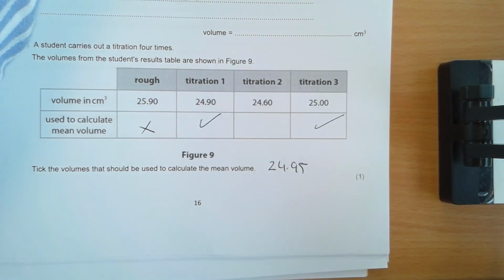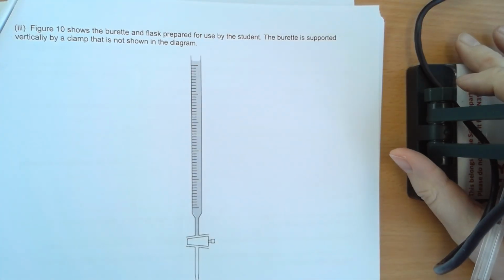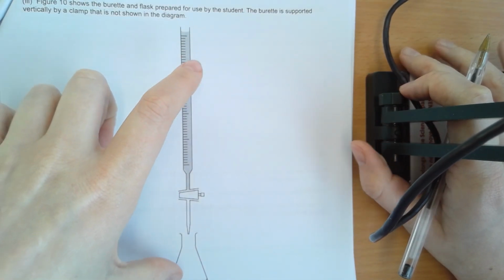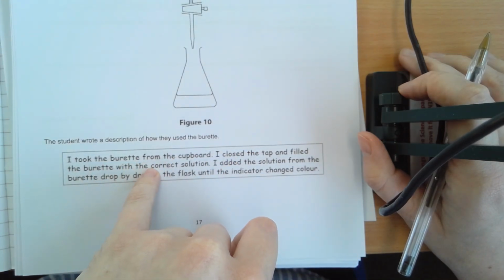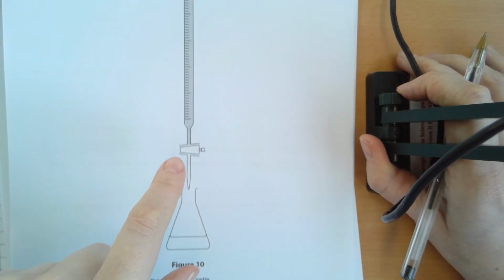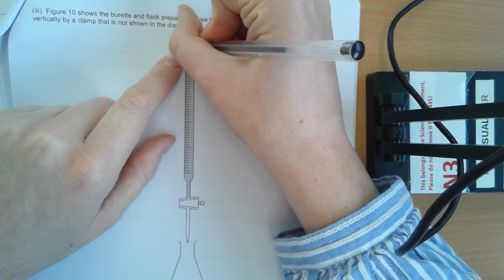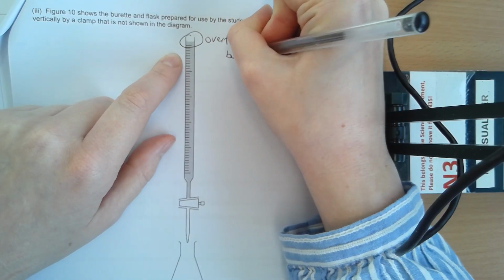The other thing they love to ask is to make improvements. There's quite a few questions that you're going to do where they ask how you'll make it more accurate. This one was slightly trickier, I think, because rather than letting you just give your rehearsed answers, they gave you a picture and they wanted to know specifically what this student had done wrong. So it says he took the burette from the cupboard, closed the tap and filled the burette with the correct solution, added it drop by drop until the indicator changed. Now there's 2 things wrong from the picture that you need to be able to spot. Number 1, okay, that's the last graduation mark and he's filled it too high. Okay, so first thing they've done wrong is they have overfilled the burette.